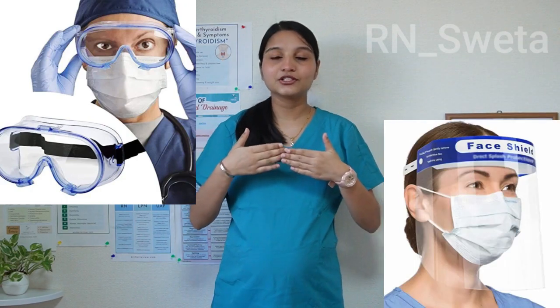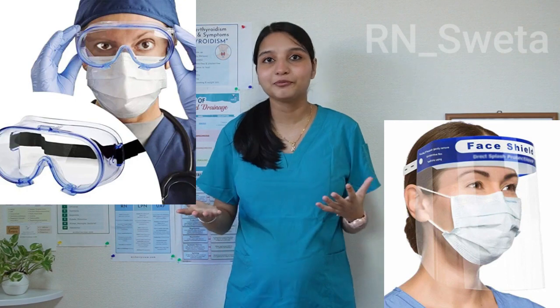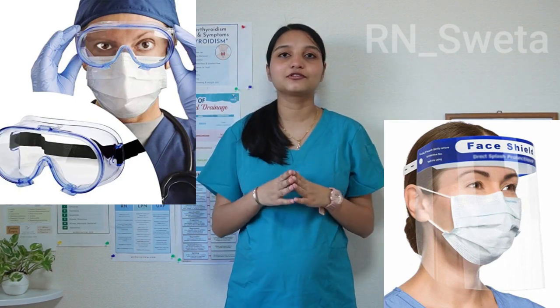Okay, now we have some of the equipment that we use in order to protect ourselves from the transmission of diseases under the standard precautions. So starting right from here, we have eye goggles, or we even have the face shield, right? You might be very familiar with the face shield after COVID.